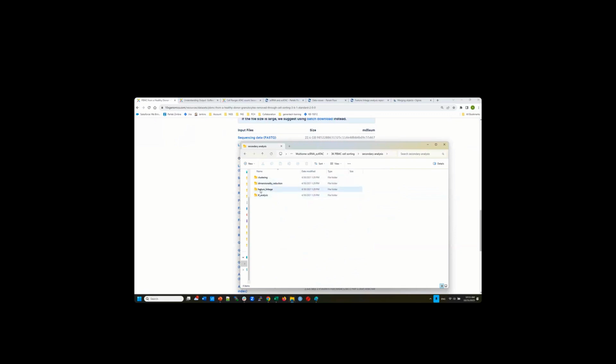They also have a file called feature linkage. If you do RNA-seq and ATAC-seq together, they will have this, and we need this file to display the linkage between RNA-seq and ATAC-seq. This is one way of integration. If you want to visualize that information, we need this file. All right, so that's all the files we need from the 10x website.